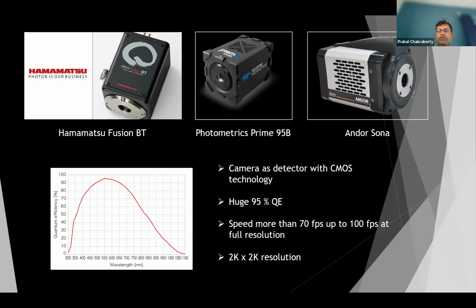So that is how, in fluorescence microscopy, you can capture very low light imaging also. These are the different parameters that I wanted to discuss, which give fluorescence microscopy an advantageous position. Now we will come to why we need a confocal microscopy over a fluorescence microscopy.